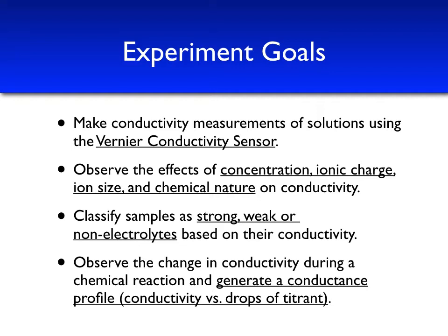Finally, in the second part of the experiment, we'll get to observe the change in conductivity during a chemical reaction by performing a titration of sorts, where we measure the conductivity versus drop of titrant added. All of those reactions are acid-base reactions.